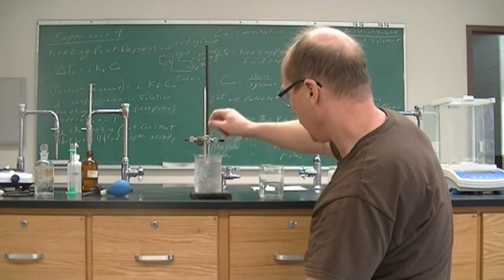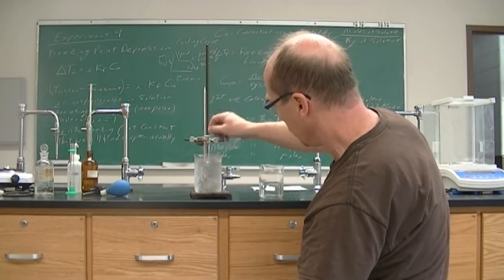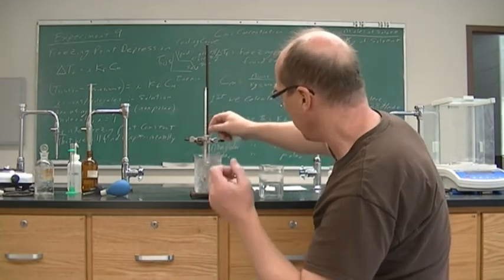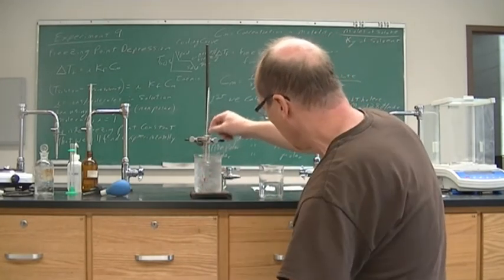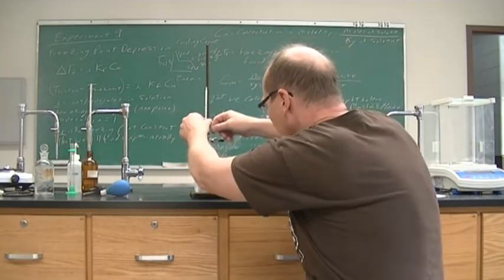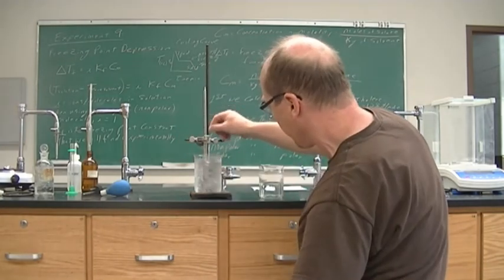When our solution with the naphthalene was solid, it was just very fine, solid particles in the solution that I couldn't see with this fog in the way. So once we get down to, say, 2, I'm going to take this out and look at it. We're only down to 7.